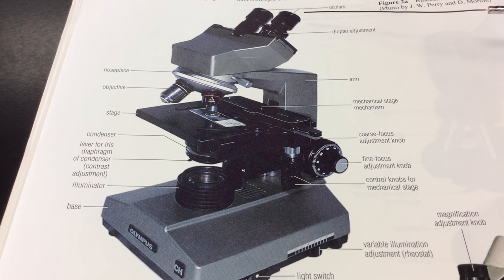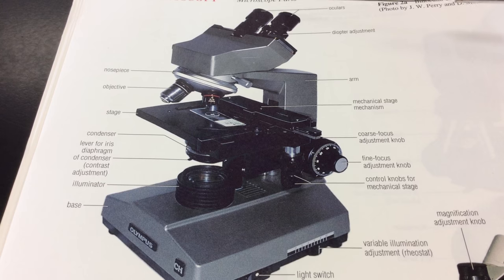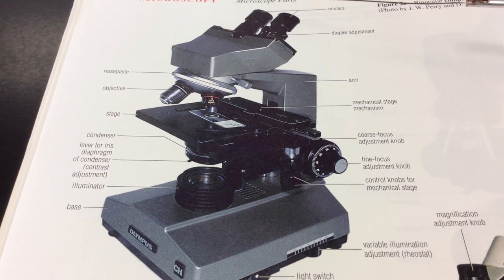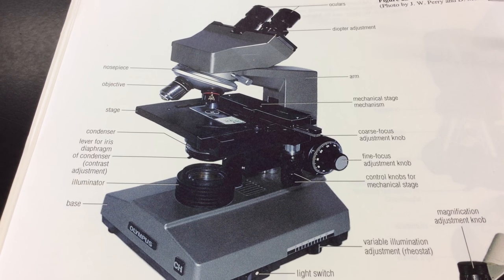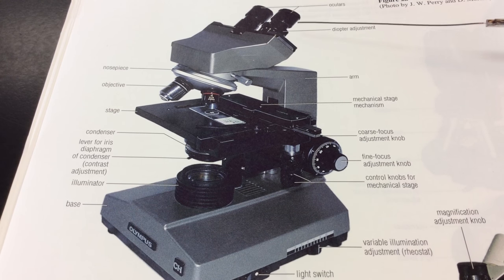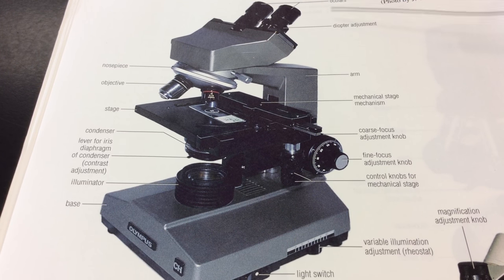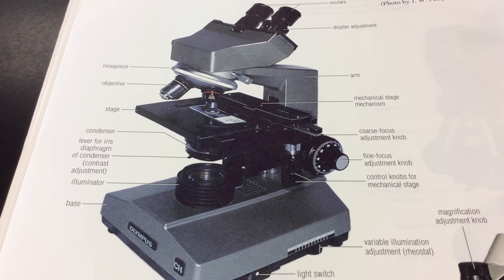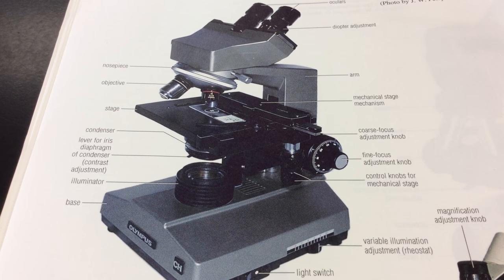The microscopes you'll be using are called binocular, meaning two ocular lenses, binocular microscopes. So here we have our two ocular lenses. And we'll discuss how we can focus the right eye separately from the left eye. Usually the correction for the left eye and right eye are different. So as part of that discussion later, we'll talk about how here, this would be the left ocular, down at the base, it's called the diopter adjustment ring. This is going to let us focus the left eye separately from the right eye. So we'll have nice clear focus for both our eyes, and that's going to reduce eye strain and reduce headaches. And some folks who get dizzy looking through the microscope, it should help reduce that dizzy feeling that can make some people sometimes want to throw up, which we don't want you doing in lab.